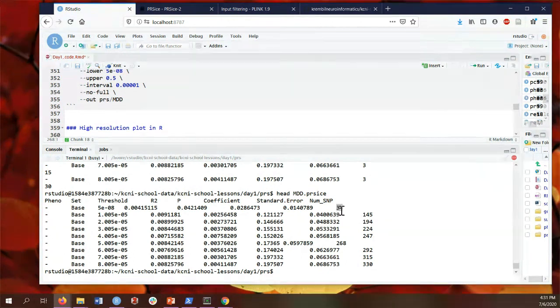And again, it's fewer than the 102 that are claimed in the manuscript, because we've performed quality control and that kind of agnostic pruning for this PCA data set. We would have a much closer number of SNPs if we use the real full genetic data set as opposed to the pruned data set.